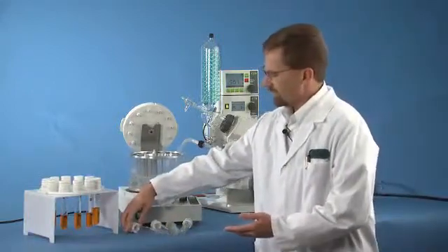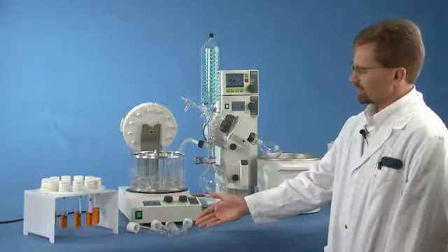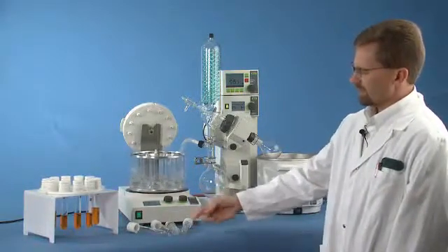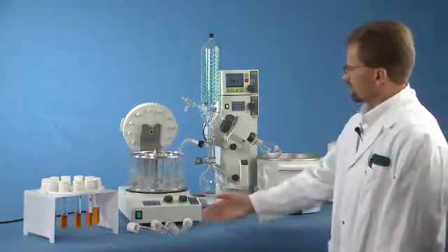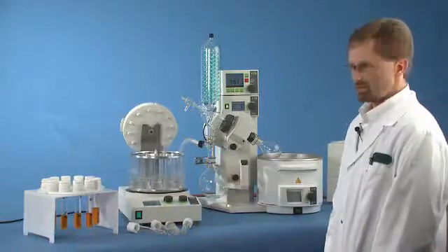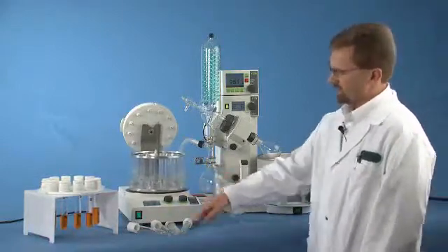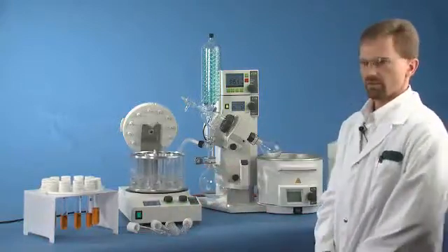And the other benefit is the fact that you can see that we have different shapes for these reactors, different lengths, diameters, and also the bottoms vary in configuration. But the benefit is the fact that the Multivapor uses water as a heat transfer fluid, so we don't have to worry about how the shape of the bottom of the vessel is in the heat source for the solvent removal.